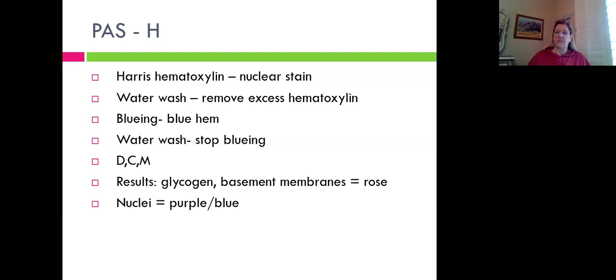Then you're going to water wash. That's going to remove that excess hematoxylin. Then you're going to go into bluing to blue that hematoxylin. Then you're going to water wash to stop that bluing.